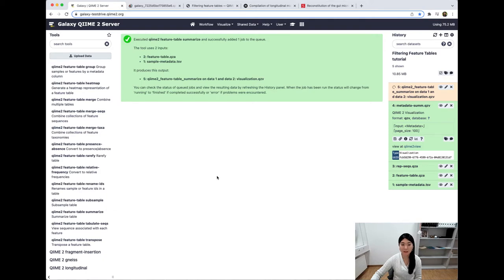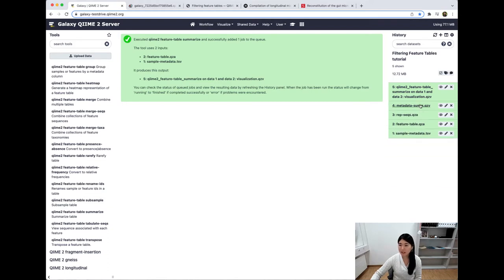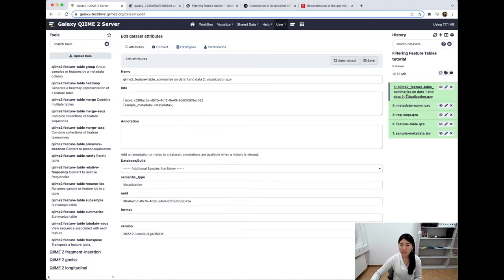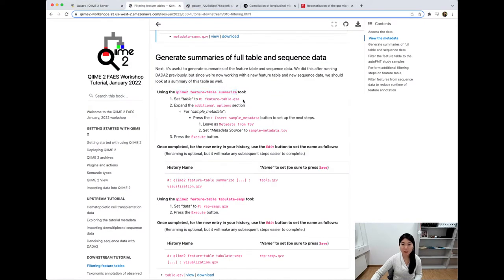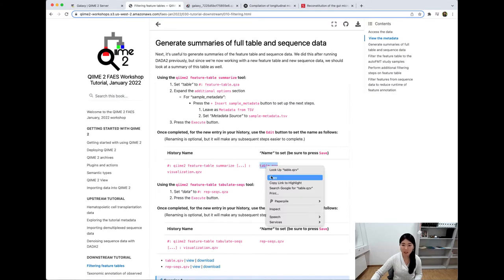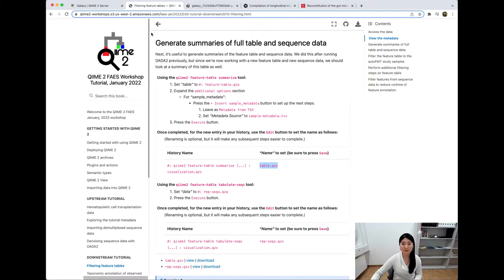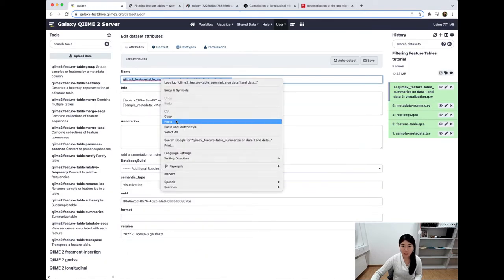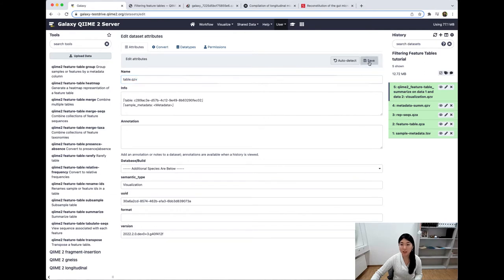That's going to run for a little bit. It doesn't really matter if it takes a while since this is a QIIME 2 Galaxy server. It's done running. Similar to what we did earlier, we want to click on this pencil to edit the attributes of this new dataset. We're going to rename this table.qzv — instead of this unfortunately long name, we'll keep it as table.qzv and save. And because this is a .qzv file, a QIIME visualization, we can also view it in QIIME 2 view.